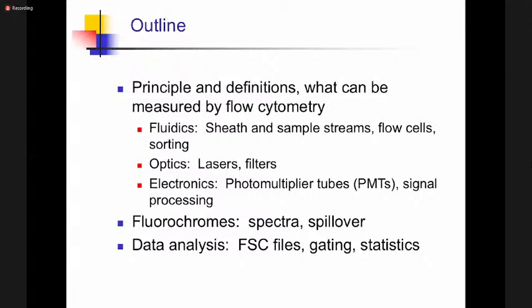But of course, the detection of the target molecule can also be the DNA, which is inside the cell. So it is not only that these dyes are going to mark the surface of the cell properties, but can also detect for you the DNA and also the chromosome number, which is within the nucleus.